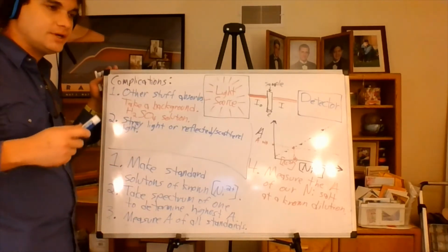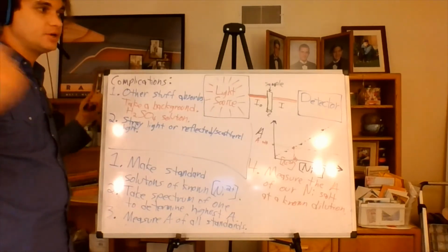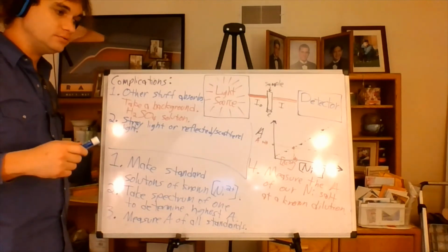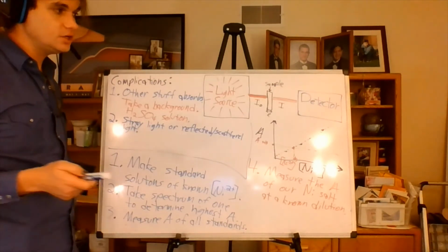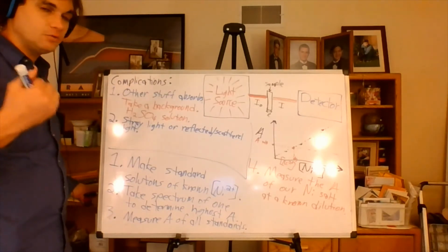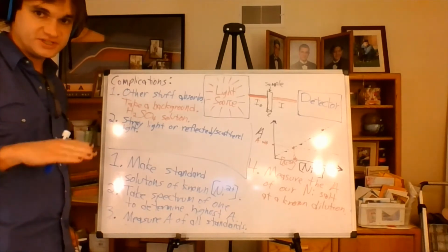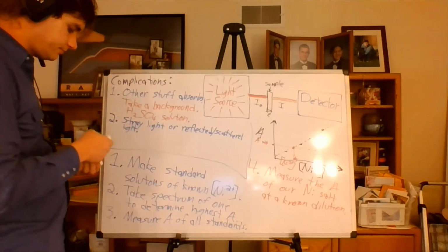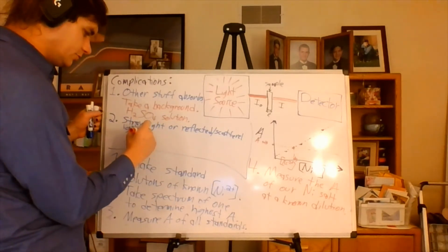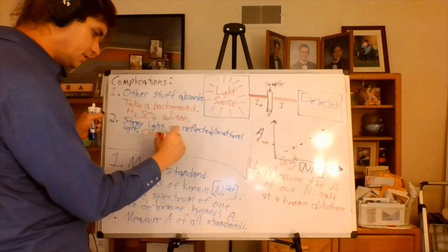If, for example, the spectrometer is open to the lab and the lights are on in the lab, you could have stray light hitting the detector from a different angle. Now, the detector is stupid. It doesn't know which light came from the light source and which light came from the outside, which is why it's very important to always close the lid before running any of the scans.